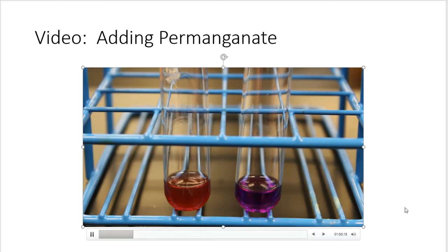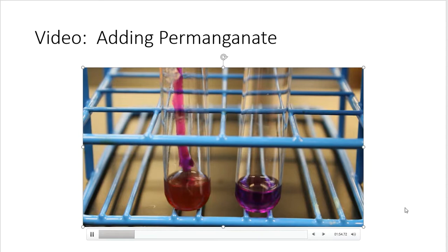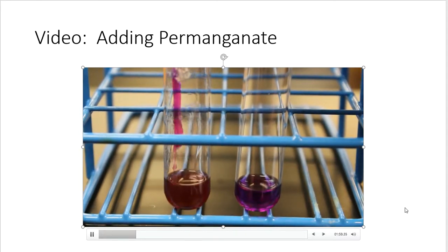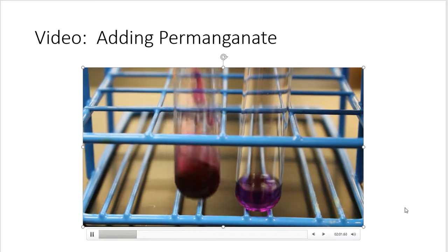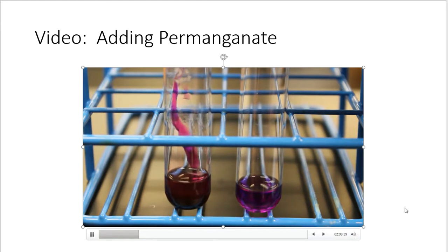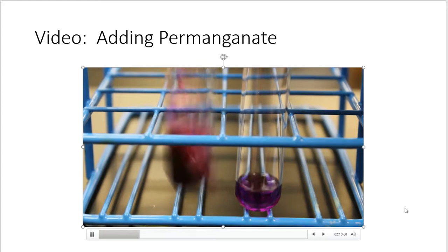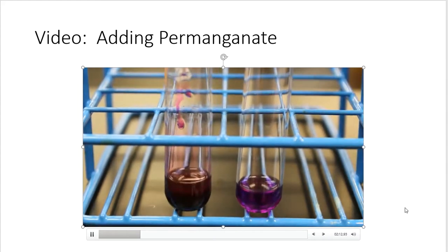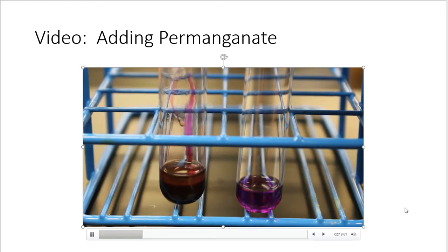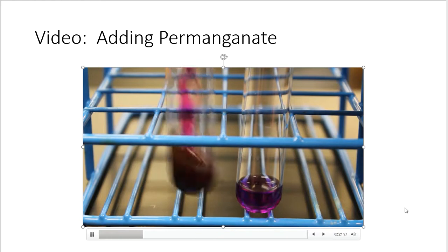All right, so there's 2 drops, and we'll just count them together. 3, 4, I'll give it another shake. 5, 6, 7. 8, 9, 10, 11. It's just getting darker and browner. 12, 13, 14, 15.